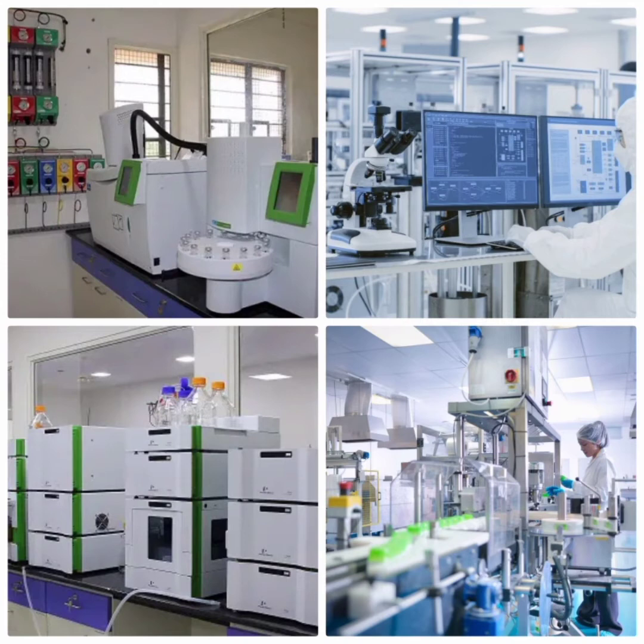If it comes to column dimensions, liquids used as carrier in HPLC generally have higher viscosity in comparison to gases used in gas chromatography. This results in increased column back pressures in HPLC. It is for this reason that high-performance liquid chromatography columns are much shorter and have wider diameters in comparison to GC columns, which can be much longer and narrower.